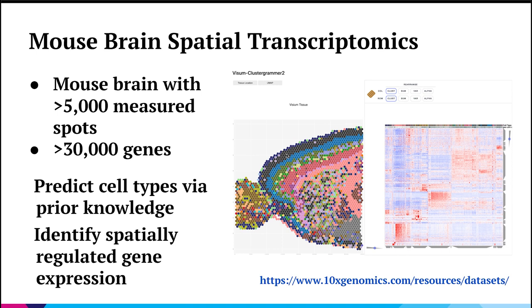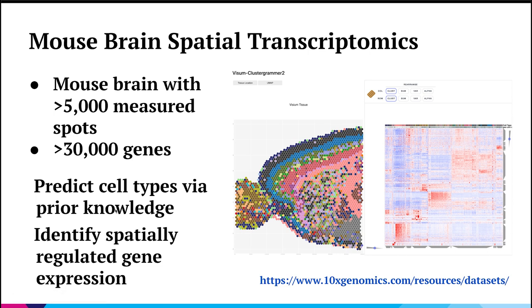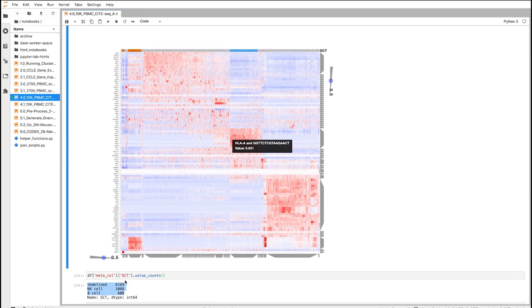We'll quickly touch base on a spatial dataset from a mouse brain — spatial transcriptomics. It's an interesting dataset where they basically took a mouse brain, put it on a slide, and they're using a technique called Visium from 10x Genomics. This data is publicly available. They're measuring 5,000 spots on the slide — each spot contains one or more cells — and you're measuring 30,000 genes. We took a previously labeled dataset, used it to generate signatures of cell type, transferred that label onto this dataset, and then built a dashboard to work with this data.